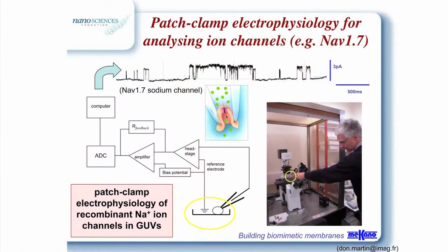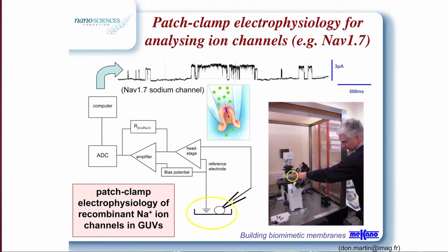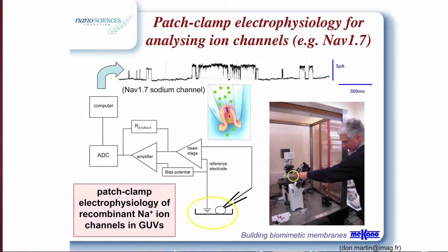And which samples do you typically work with for the patch clamp? Yeah, mainly liposomes and channels expressed into liposomes. Unfortunately we haven't patch clamped many real cells recently, so most of the work is done with purified ion channels that we incorporate into liposomes that we can patch clamp and measure the properties of those transporters. They're the transport proteins that we need to know precisely the characteristics of so that we can use them in the biomimetic devices that go into the tethered and supported lipid bilayers.